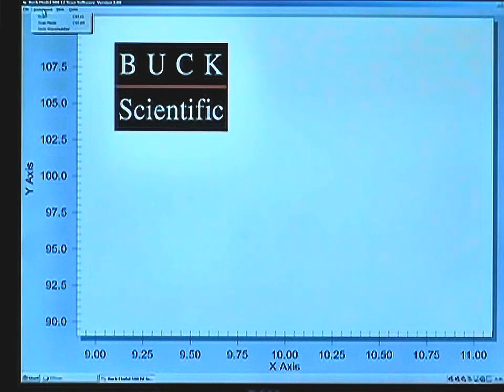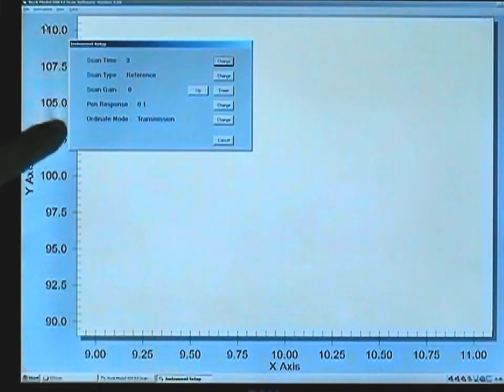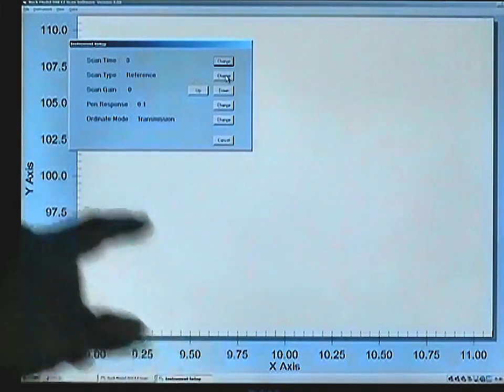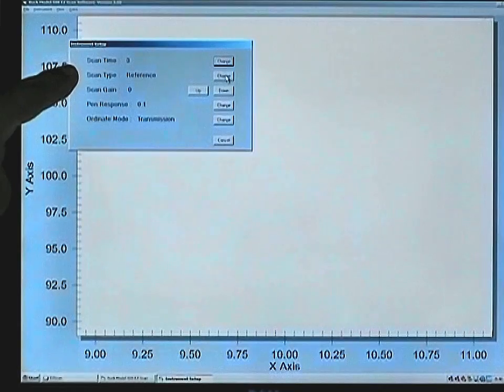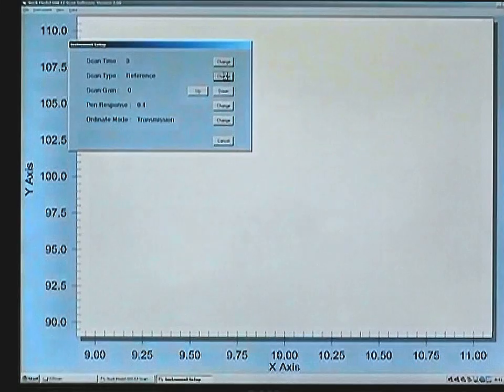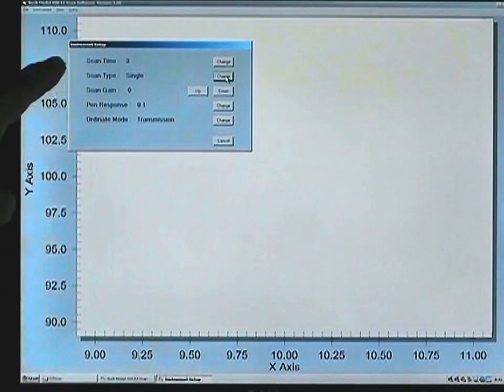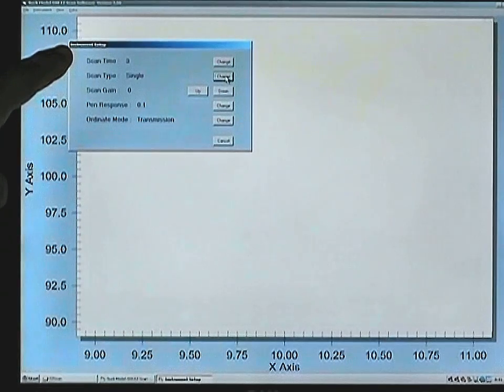You can go to Instrument, Scan Mode, and here's where you can change the parameters for the setup of the instrument. It is recommended to change the scan type from the default reference, click on Change, and set that for the single beam mode. Scan time of 3 is the usual default.